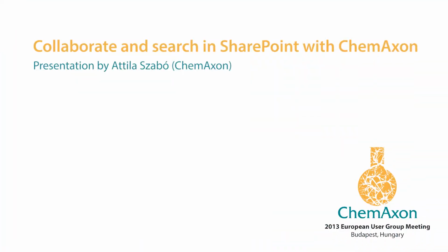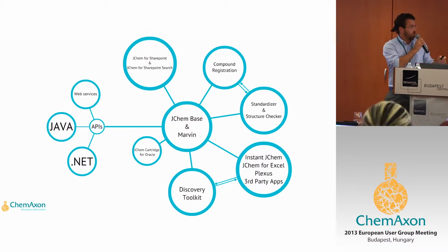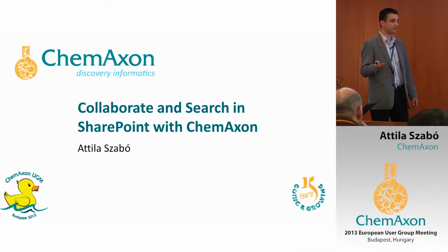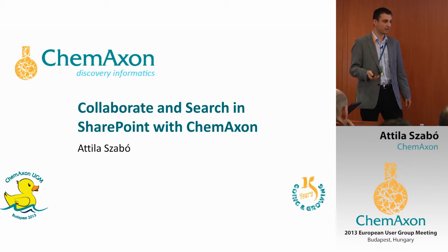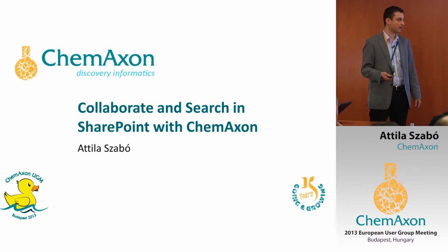So we've discussed, we've covered most of these points, and the only point we haven't covered so far is the SharePoint platform and our integration into SharePoint. So I'd like to ask Attila to come forward and tell us what is new and what we do in SharePoint. Hi everyone. So in this presentation, I will talk about not just the ChemAxon platform, but how it is integrated into a different platform, namely Microsoft SharePoint.